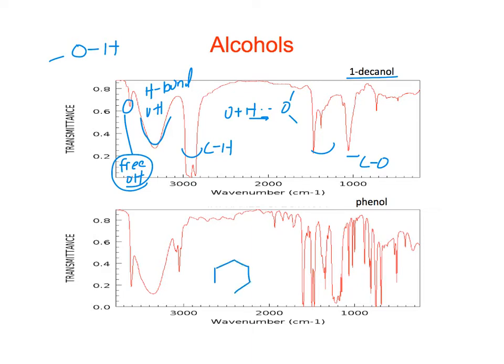All right, so forget about the fluorine hydrogen bond. This is phenol here, right? So again, we see the OH hydrogen bonded, the free OH, right? We see the overtones, so we can identify that it's on a benzene ring, and probably this big, broad, strong one here is the carbon-oxygen stretch, and in here are the carbon double bond stretches.